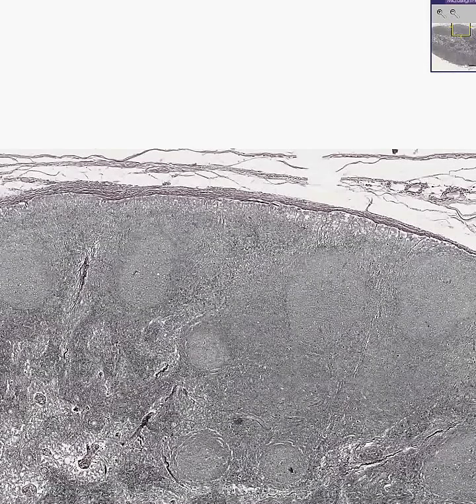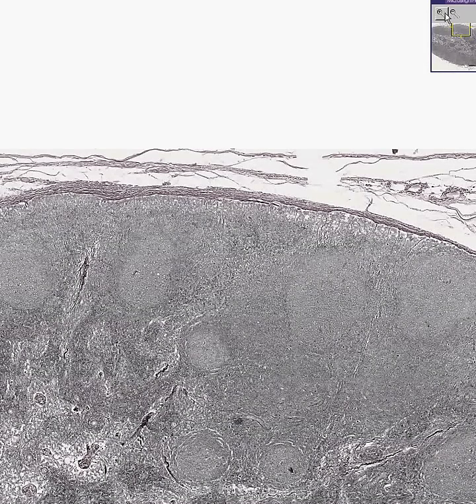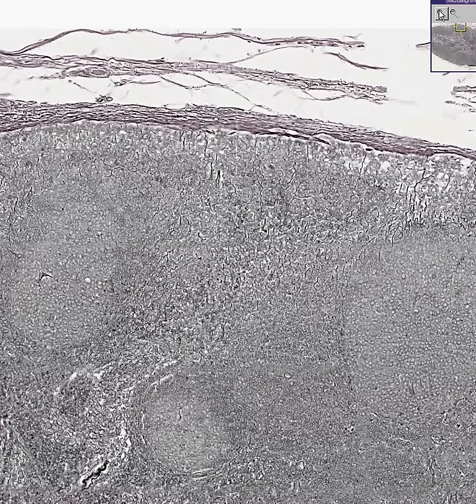I'm going to take less than one minute to show you a special stain of a lymph node, which could basically be a special stain of any lymphoid organ or lymphoid tissue. This stain is primarily directed towards reticulin fibers.